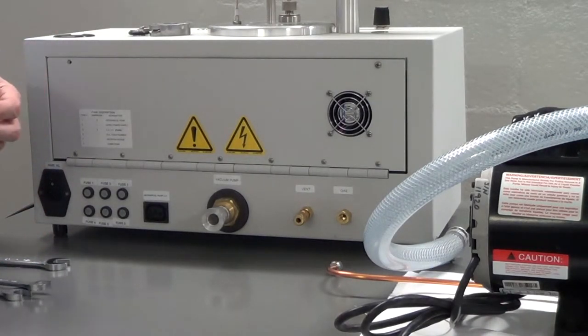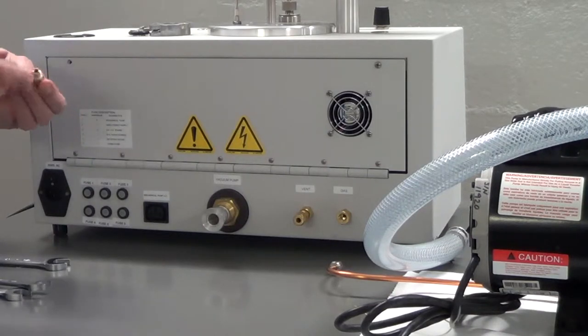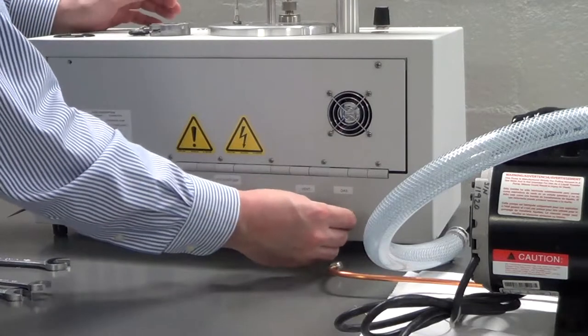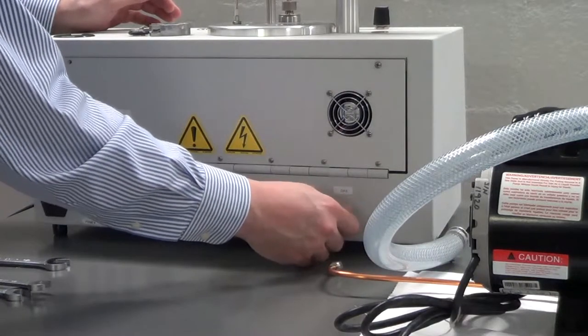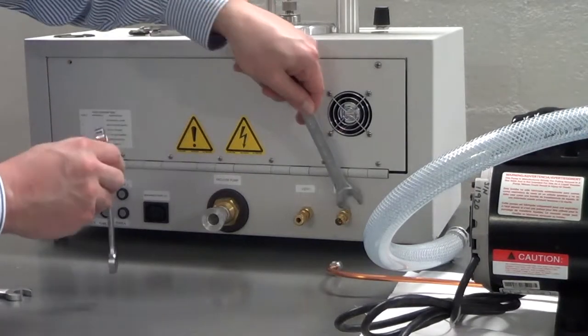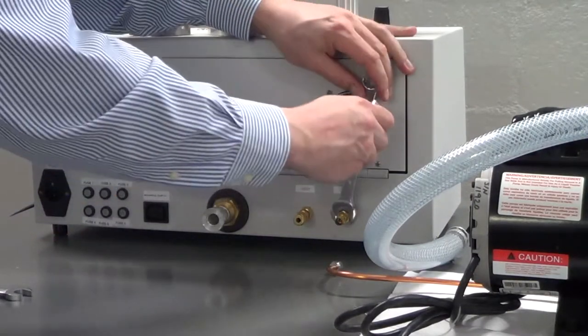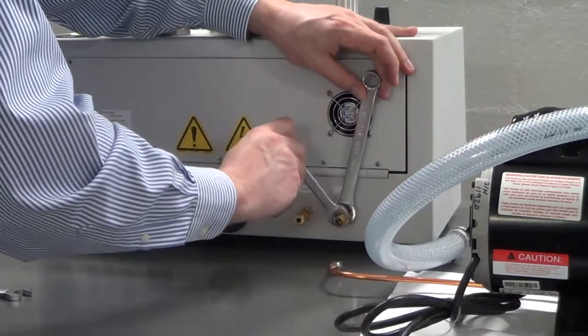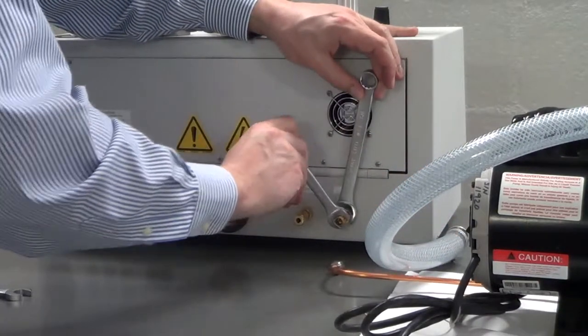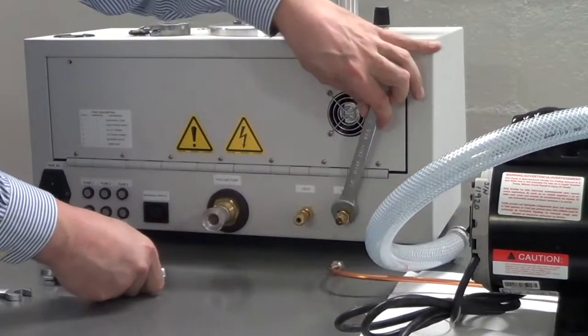Start by connecting the process gas line, typically argon. You'll want to use an adapter to go from the 1/8 inch female NPT fitting coming out of the back of the system to whatever type of connector you're using for your gas line. In our case here, we have a 1/4 inch Swagelok adapter, which is the preferred connector. Secure the adapter into the port labeled gas.